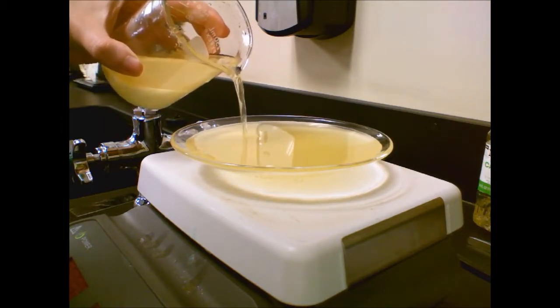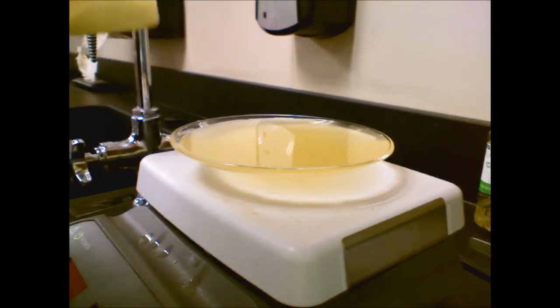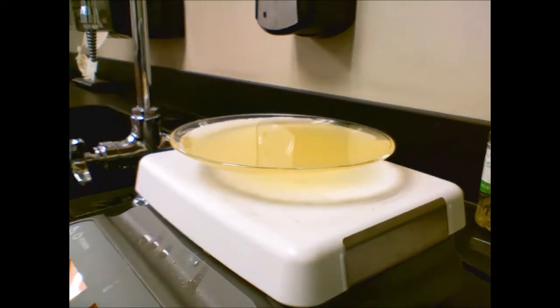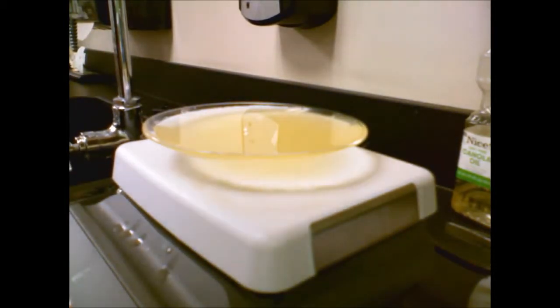So we fill the watch glass right up as high as we dare. I may have dared a little bit more than I intended to dare. Set aside the beaker, nothing dangerous about that. And we can see a little better that we have very much just a clear yellow solution. So come the morning, that will be full of small crystals.